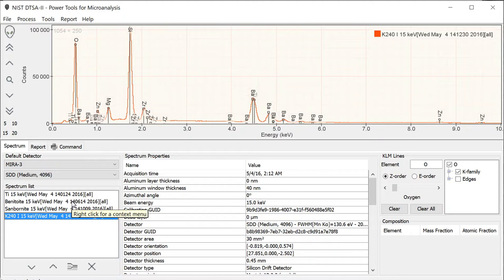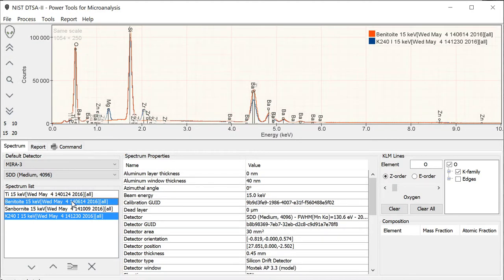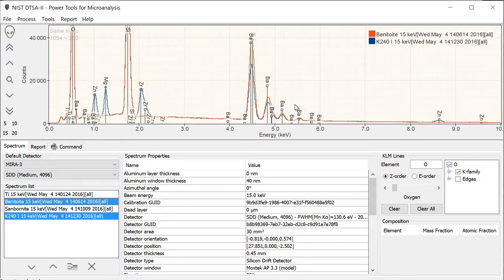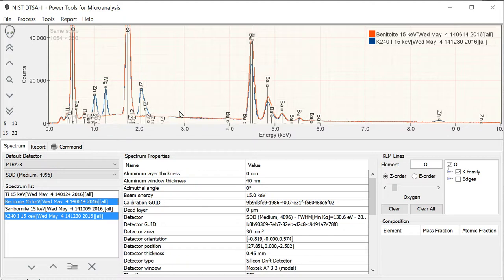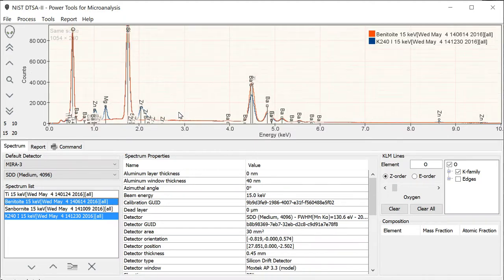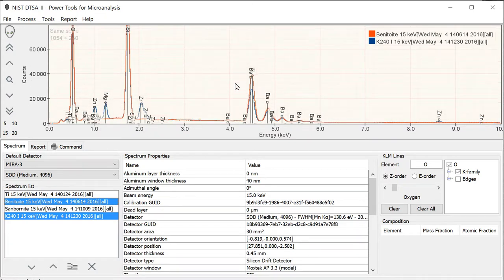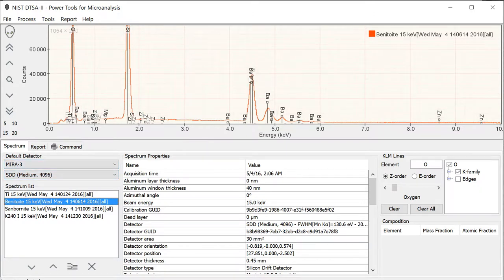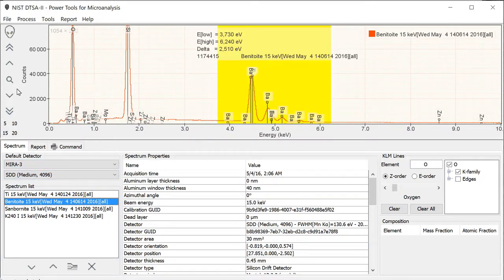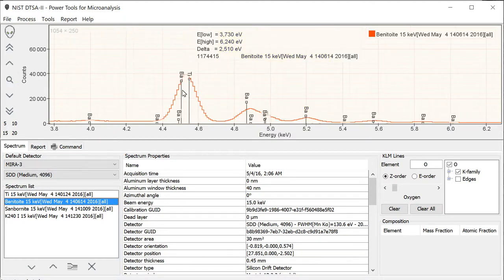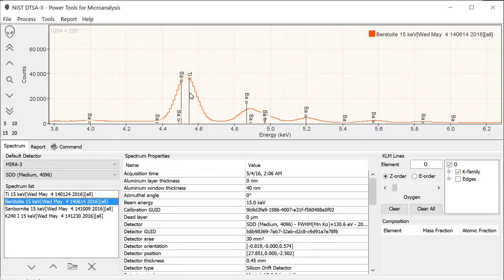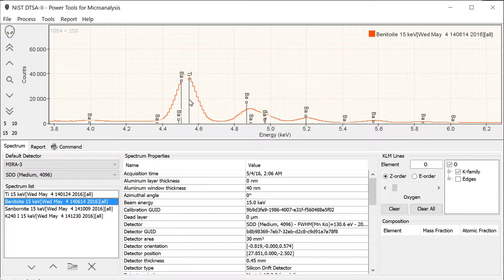We could choose something like benitoite, which is now displayed as the red spectrum. As you can see, the relative intensity in this region is very similar, and the K240 differs in that it has some additional zirconium, magnesium, and zinc. So we would like to use something like benitoite as a standard, but benitoite has a problem. In this region, if I zoom into it, there's this interference. Not only is there a barium peak here, but there's a titanium peak right next to it.